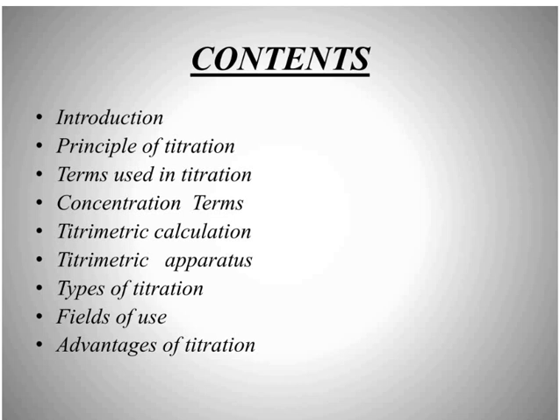So in this video, I will talk on introduction, principle of titration, terms used in titration, concentration terms, titrimetric calculations, titrimetric apparatus, types of titration, fields of use, and advantages of titrations.